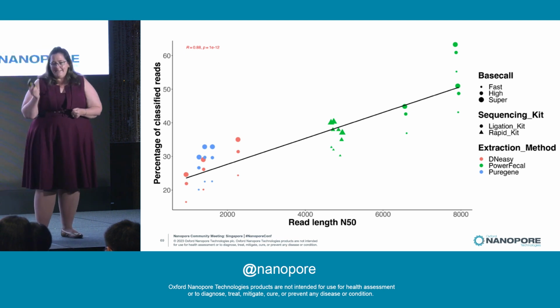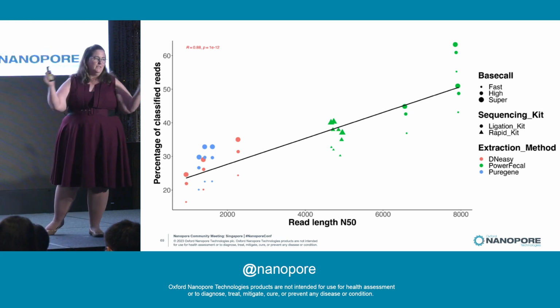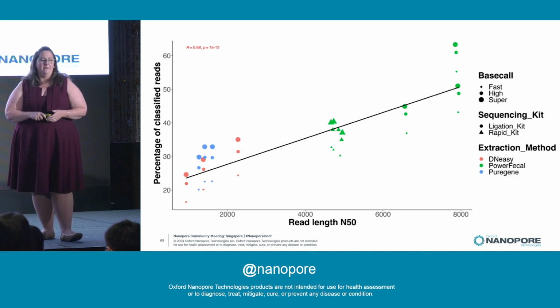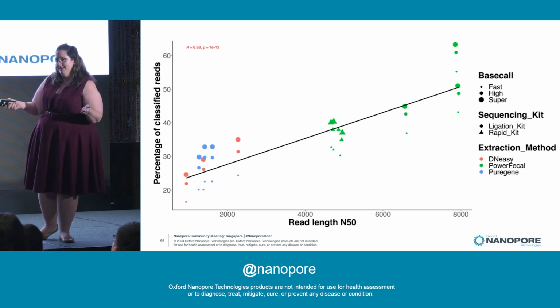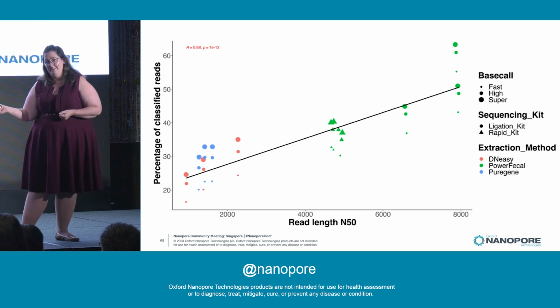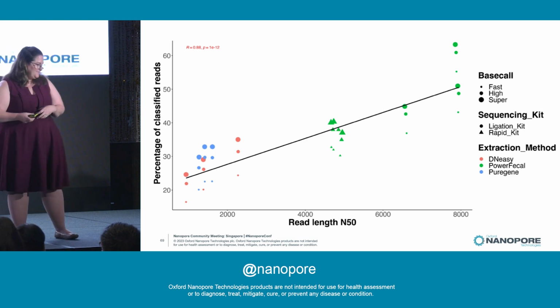And overall, the biggest thing that affected how usable those reads were was just the read length. That's it. If you get longer reads, they're more classifiable, you get more usable data out of what you sequence. The other thing he saw was that if you use the higher quality base calling algorithms, you can get up to a 10% bump in the classifiable data. So instead of only being able to use 6% of our data on the short read systems, now suddenly we can use up to 60% of our data. And that means we have to produce a lot less data. And of course, data management is kind of annoying, so that's great. Really happy with that.